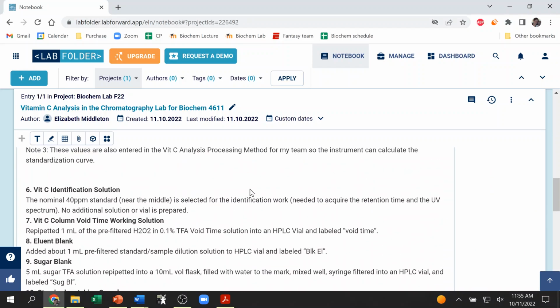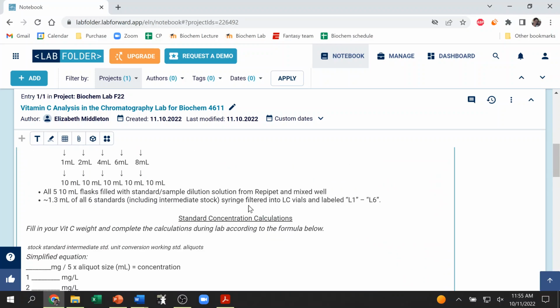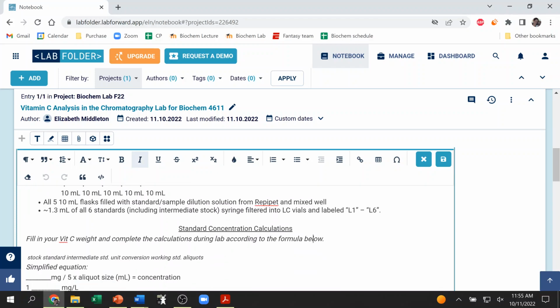Because we didn't put that directly in the procedure, right? It was supposed to be right here. So instead of formula below, oops, where'd it go? Let's say formula at right.